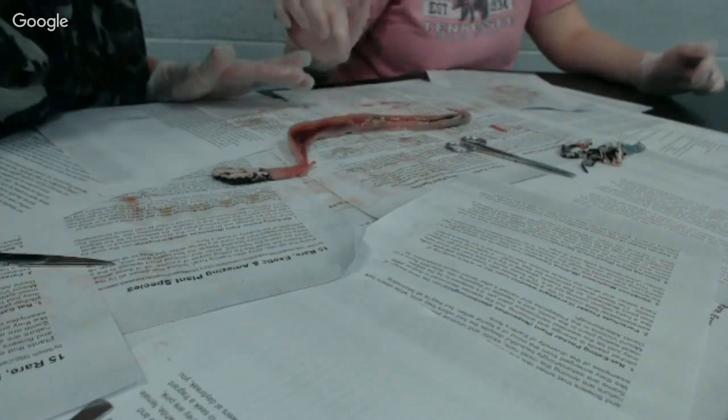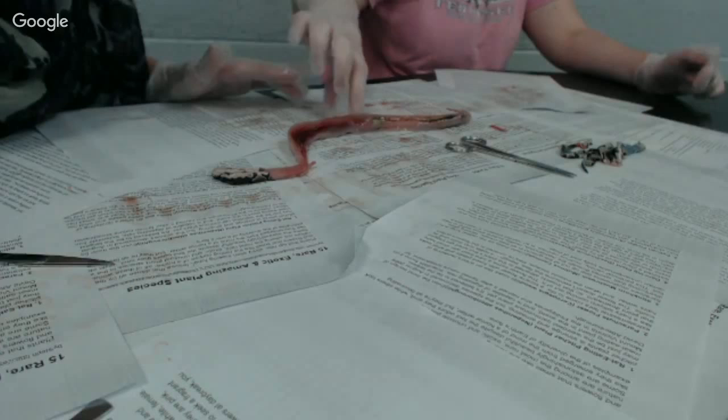Okay, we're finding the... Is that eggs? No, he said it might be fat. Look for the lungs and I'll pull it.